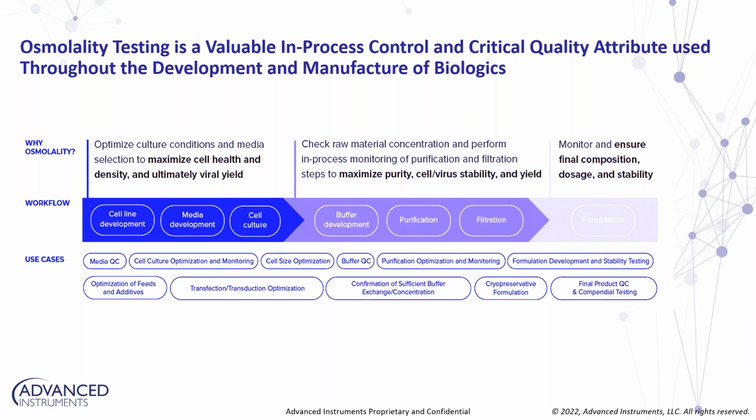As you can see here on the slide, there's a lot of different applications for osmolality testing, but this is just pure application. There's another layer that sits on top of this that's a regulatory impact, and that's really where today's discussion is from a data integrity perspective. If you are getting an osmometer into your lab to solve media QC needs, or confirming your buffer exchange process, or doing your cryopreservation formulation, you still want to know if that instrument fits into your GMP environment or your GLP guidelines, etc. A big aspect of that is data integrity, and let's jump straight into that next.